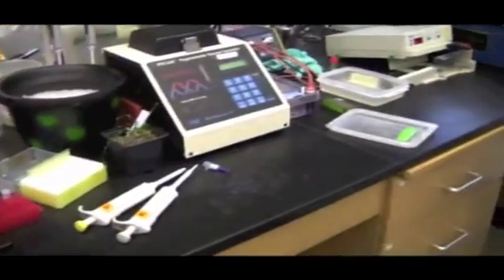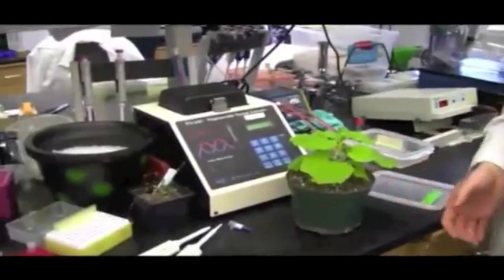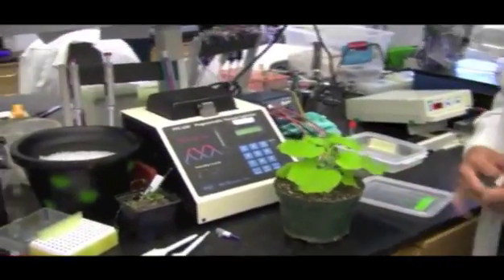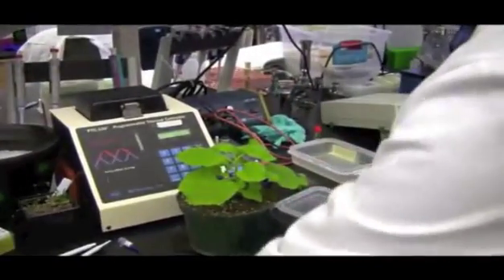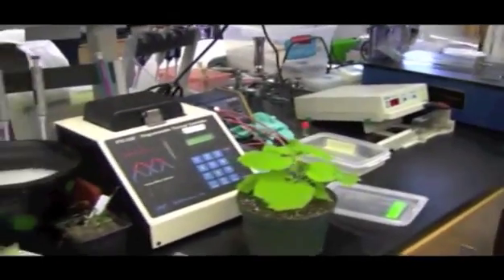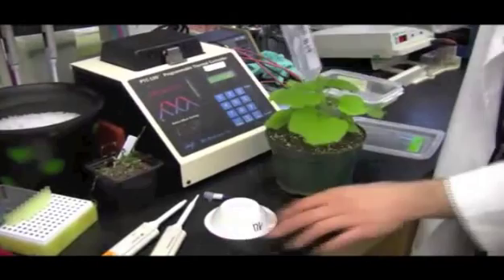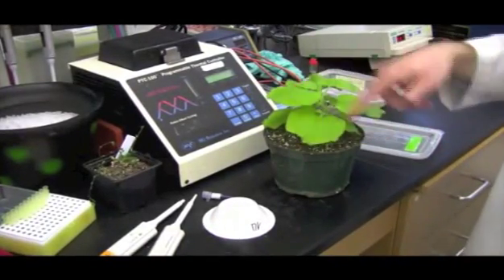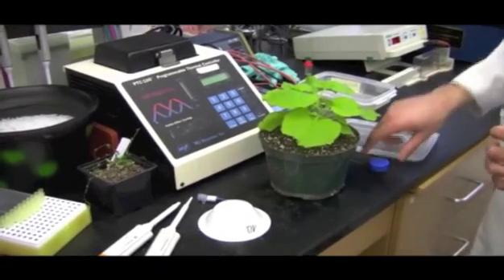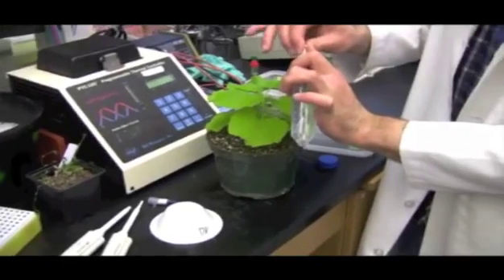Alrighty. So this is a plant called Nicotiana benthamiana, or benthy for short. And we use this because these nice big juicy leaves are very easy to infect, and Agro likes going in there and infecting a bunch of cells. So here is our bacteria mix, and you guys may not be able to see, but there's tons and tons and tons of little bacteria in here. And so I'm going to take this and I'm going to inject it into a couple leaves right here. So draw out some of our liquid.